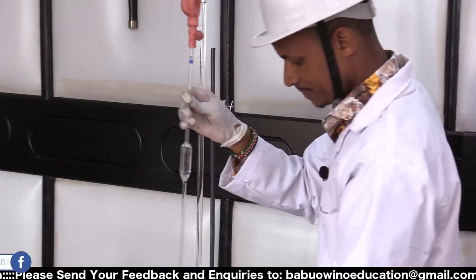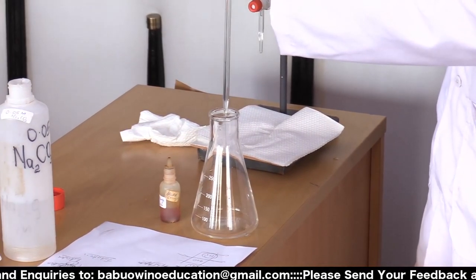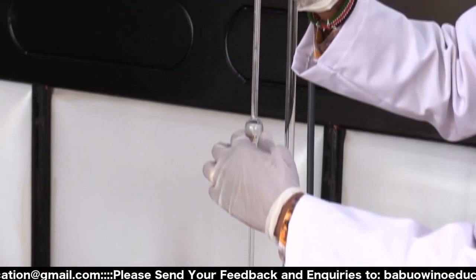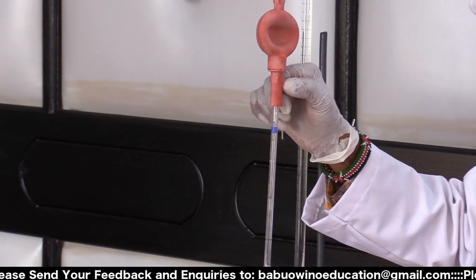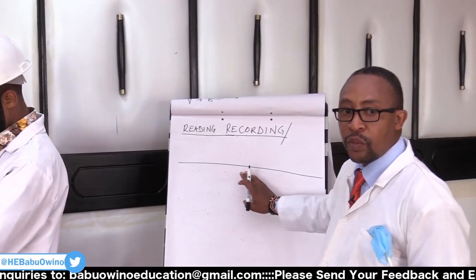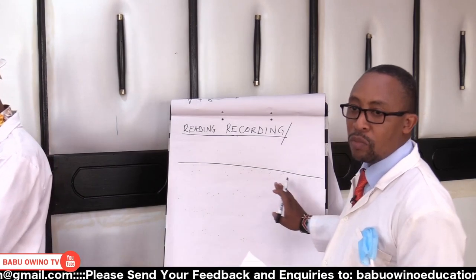Then after that, in a clean conical flask, you release. So you just press it, you release it inside the conical flask. Then note that we'll be adding an indicator. Why did we choose methyl orange in this case? A strong acid, we can use any indicator. I say that again. A strong acid reacted with a strong base, any indicator would work. But a strong acid with a weak base, we use methyl orange. It is the most appropriate indicator.